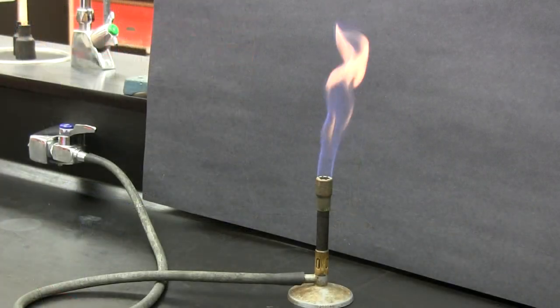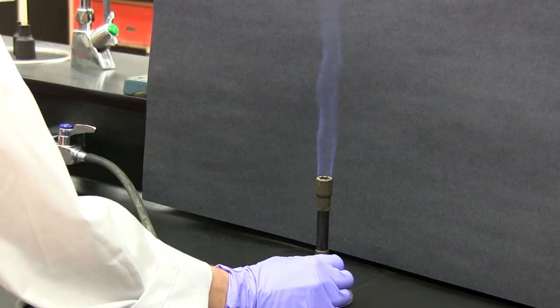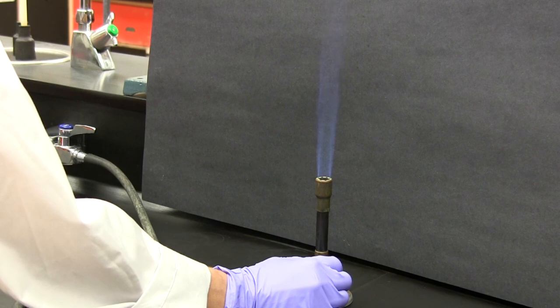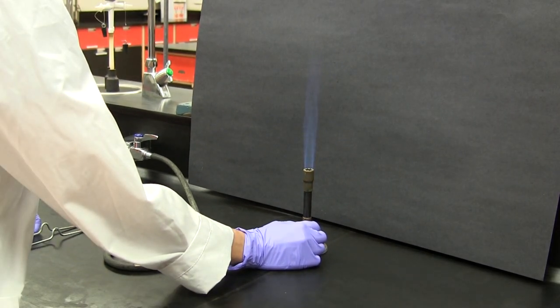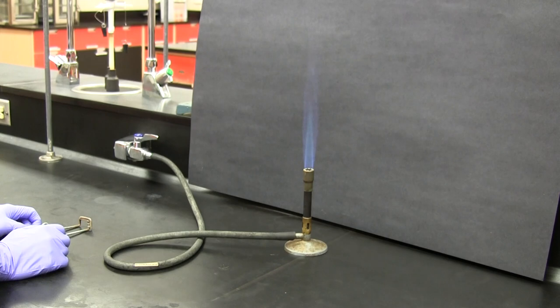But by opening the air vent, we get more air and therefore oxygen to mix with the gas and produce a cleaner burning flame. A blue flame is a clean burning flame.